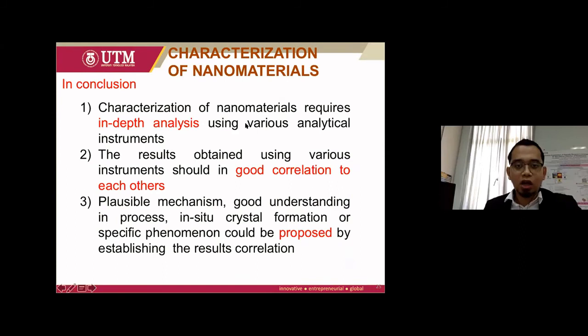All right, for the take home message that I would like to emphasize here. Take note that the characterization of nanomaterial requires in-depth analysis using various analytical instruments. You already submit your sample to various instruments, you already obtain the data, but the data wouldn't be very beneficial if you don't do any in-depth analysis. And when you have the analysis there, make sure the results obtained using these various instruments are in good correlation to each other. They must support each other. You cannot have a single characterization and say that this contradicts the TEM, the SEM. Things that work around a similar principle must support each other. That is the thing that you have to consider.